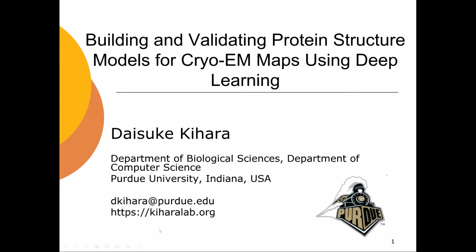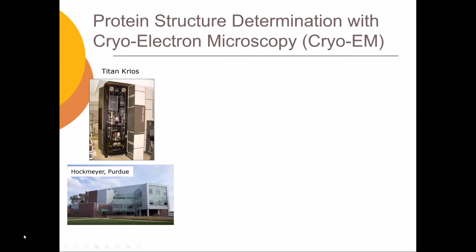I have been working on protein structure modeling and recently working more towards modeling for cryo-EM. And today I'll show you several new things we have been doing recently. There are many computational tools used in cryo-EM structure determination.